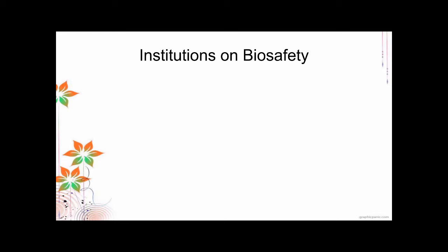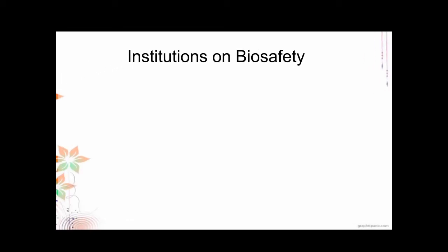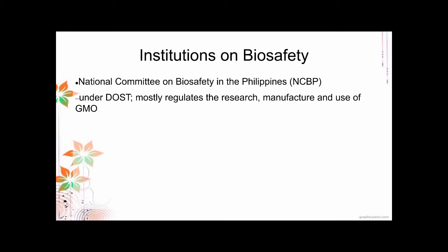In the Philippines, we have several institutions on biosafety. These are implementing bodies that audit laboratories for biosafety. We have the National Committee on Biosafety in the Philippines, NCBP. This is a body under the DOST. If you look at their website and their regulations, they do most of the regulations on the research, manufacture, and use of GMOs.